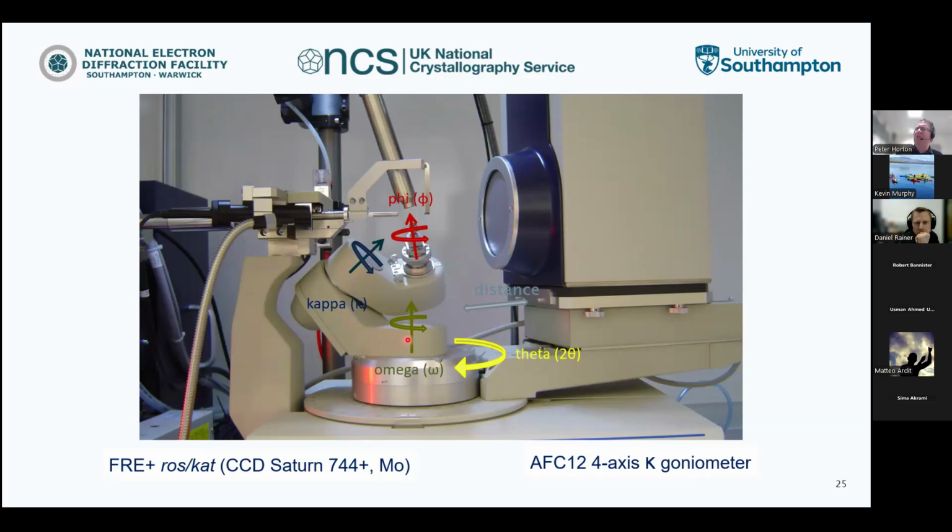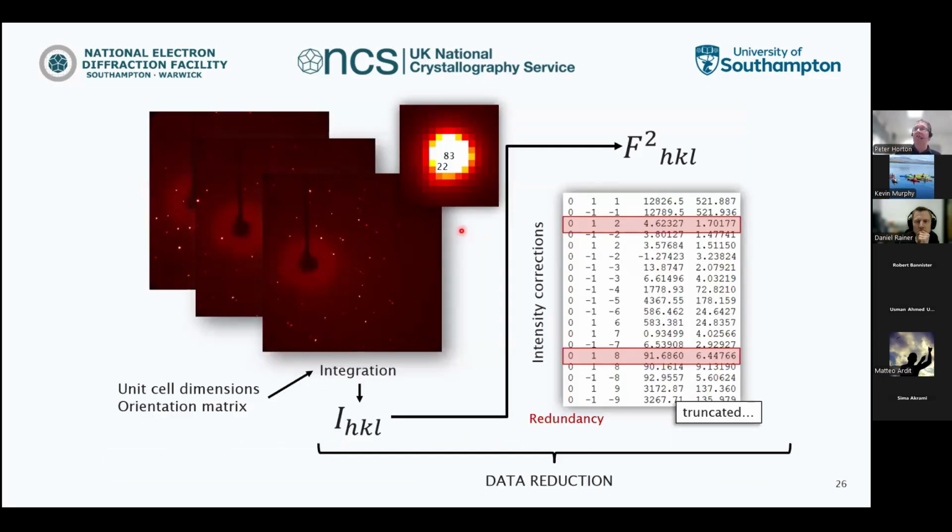So with this, generally the coverage of the crystal, we can move it around to pretty much get the crystal to exist in any position in relation to the beam and then detect it. So we collect our images. We collect hundreds, possibly thousands of images. We measure their intensities. It's nicely done by the computer for us, how strong they are.